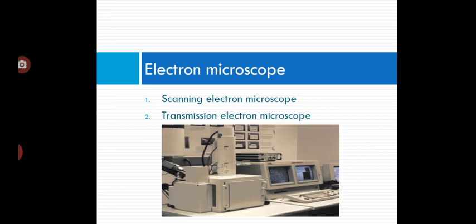The scanning electron microscope is a recent development which provides a higher resolution and three-dimensional image of the specimen.